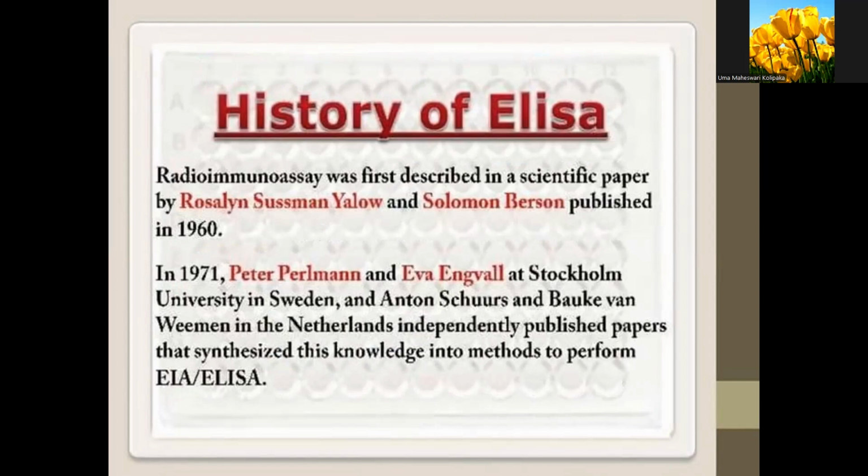Next, coming to the history of ELISA. Radioimmunoassay was first described in a scientific paper by Rosalyn Sussman Yalow and Solomon Berson, published in 1960.